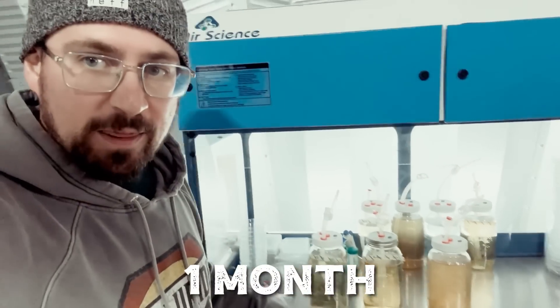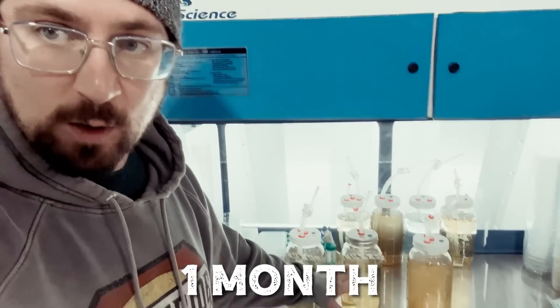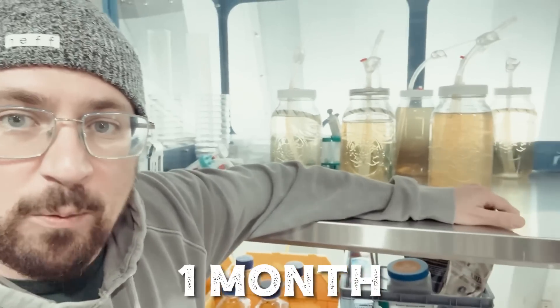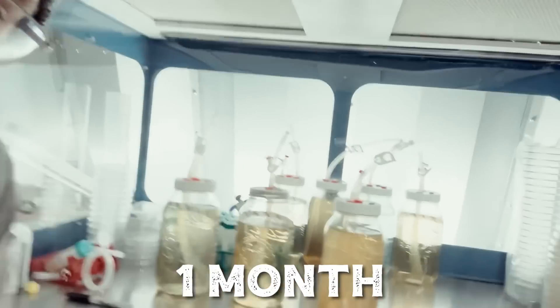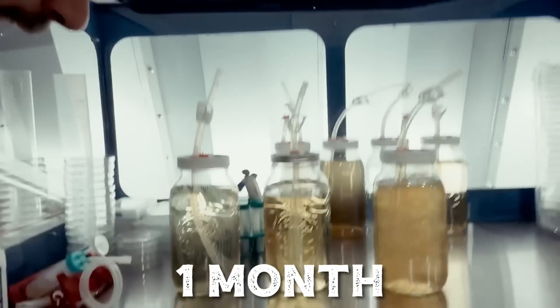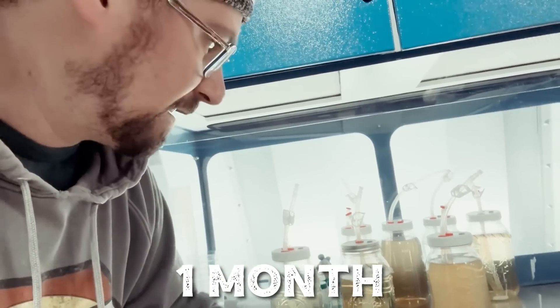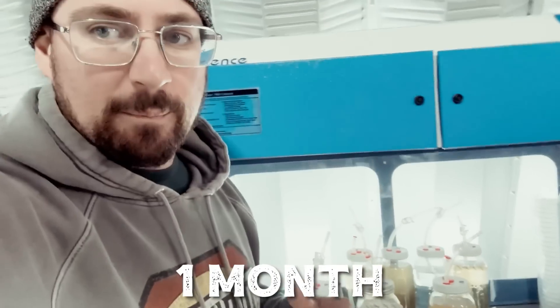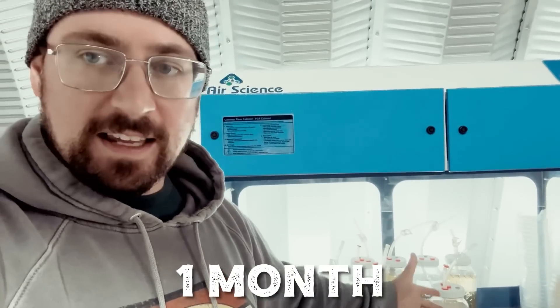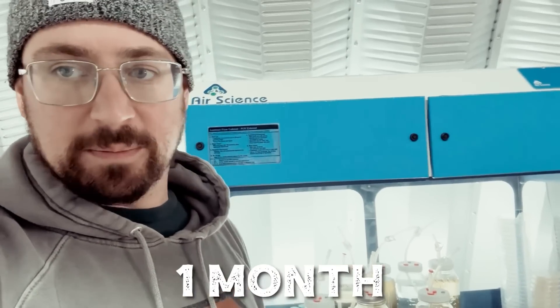It's been about a month since I started the liquid culture experiment with the honey water, peptone broth, and tryptich soy broth, and there's a definite winner. The honey jar really took off after about a month, while the other jars are starting to show more mycelium but it's definitely delayed. The honey is definitely the best liquid culture for this strain, and I encourage everyone to try experiments like this with their own strains, because you can optimize growth just by changing a simple recipe.